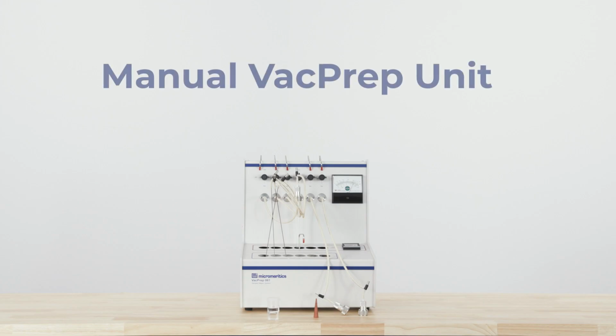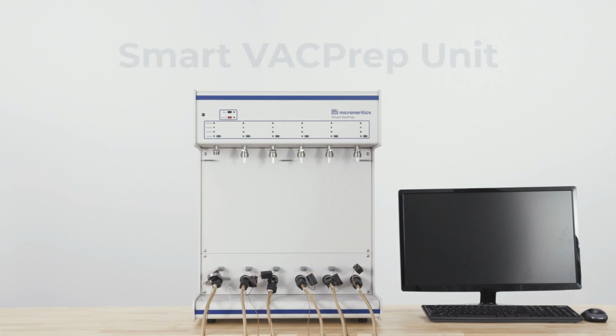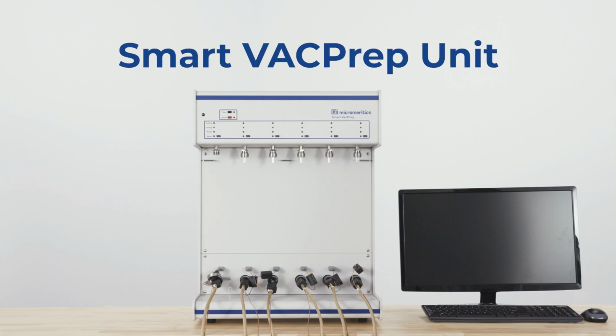Another option is the Manual Vac Prep, which pulls a vacuum onto the sample while heating to a fixed temperature across 6 ports, allowing it to remove contaminants. Lastly, we have the Smart Vac Prep, which allows you to set up pre-programmed degas conditions that are independent for each sample port. That is just a quick demonstration on how the 3Flex can be used to collect a nitrogen physisorption experiment in your lab.